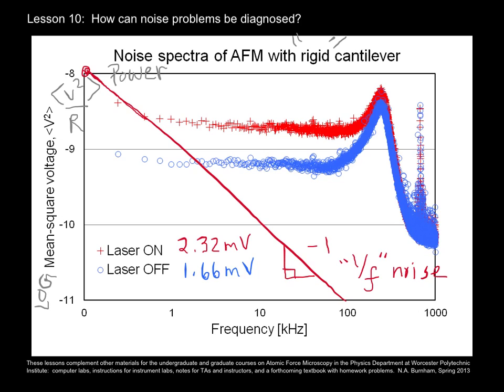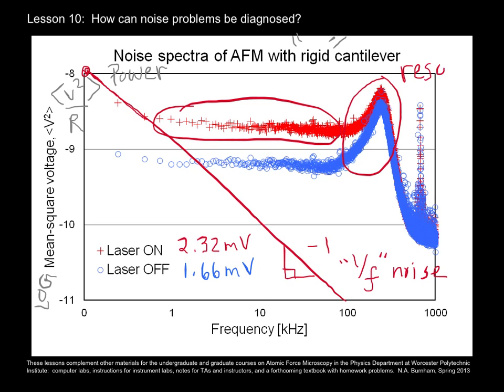Then we have a fairly flat frequency range here. This is the range over which the manufacturer thinks that most measurements will be made. Then here we have some resonances.